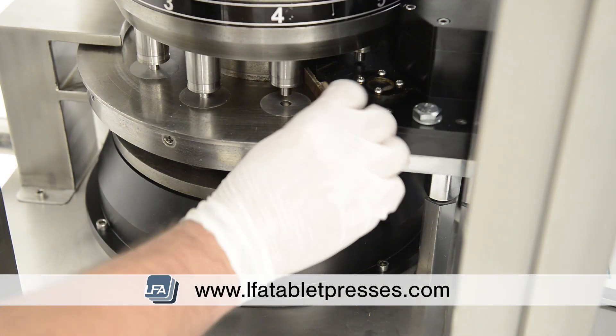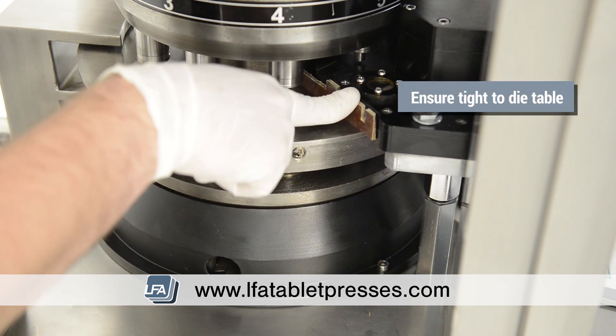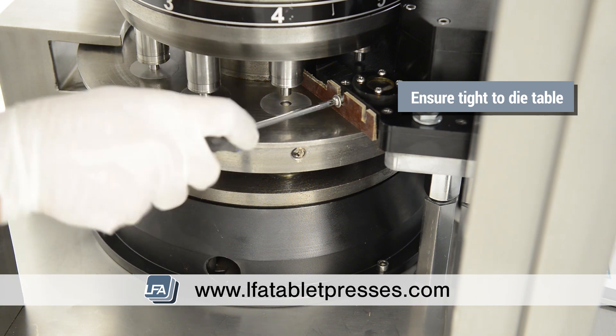Replace the scraper blade. This is a wear part that will wear over time. Firmly push down the scraper blade and tighten with a crosshead screwdriver. This part needs to be tight against the die table to stop excess powder from escaping.